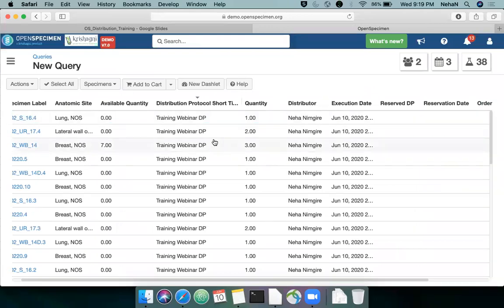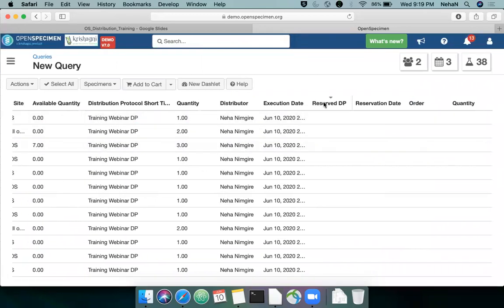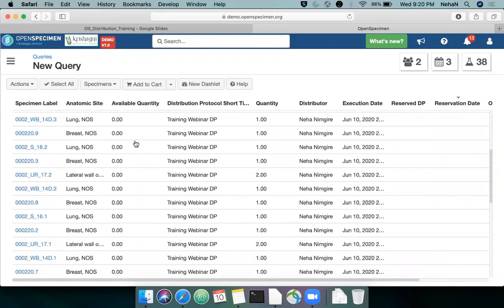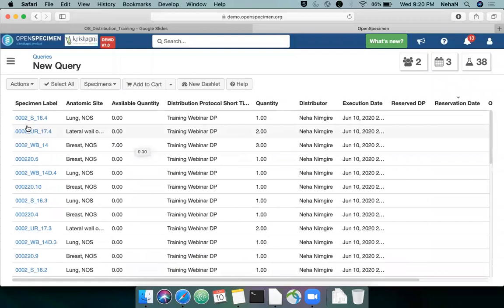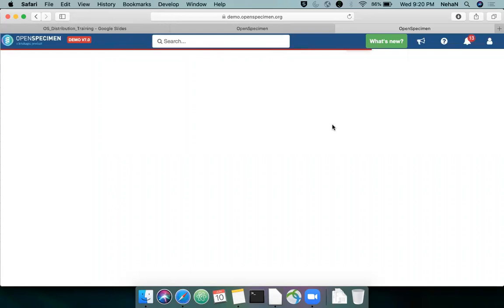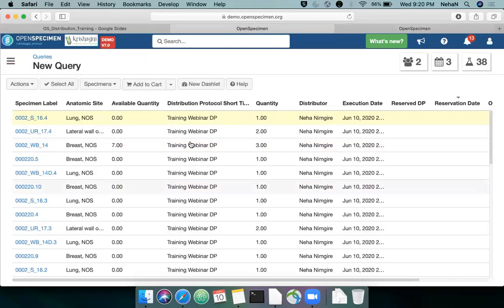So these are the training webinar details. If you filter based on that, these are all the samples that were distributed. If you go to any one of these, it will show you the details for the distribution as well. So this was distributed, and all these details are populated over here.